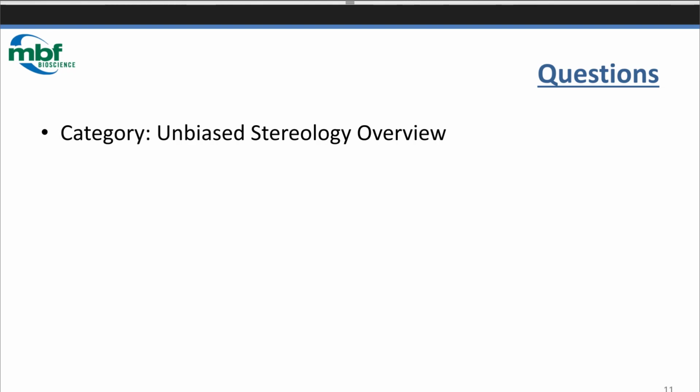Will we have access to the video afterwards? Yes. How do you determine how often to sample slices? I'm going to get to that when we talk about precision. Okay, here's a good question from Krista. How can you best do systematic random sampling in human brain tissue when sometimes we do not have sections through the entire region?